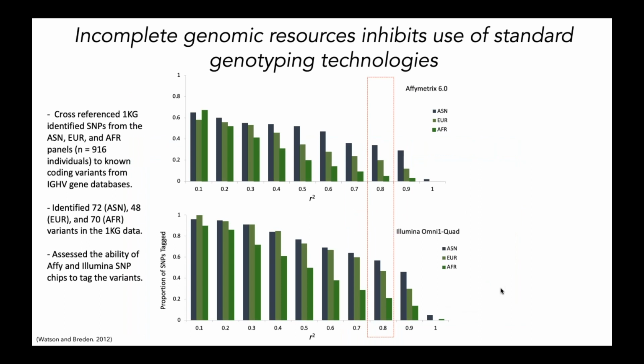In addition, we know the complexity has also impacted how GWAS has been done using microarray technologies, often for much of the same reason: placing targets for microarrays can also be challenging in repetitive sequence. If you look at the performance of two commonly used microarrays that have been used a lot in GWAS studies, we can see that these actually do a fairly bad job of tagging variation within V segments.